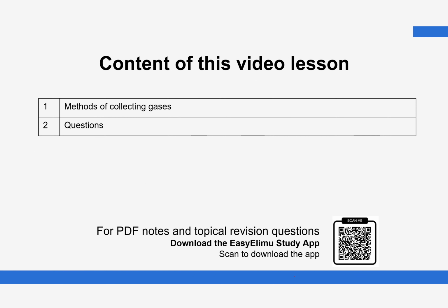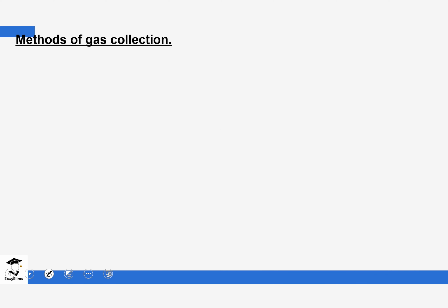So for today, we'll look at the methods of collecting gases, and then later on, we're going to look at some questions that focus on what we are discussing. Depending on the method of collection that we choose for different gases will be determined by different characteristics.